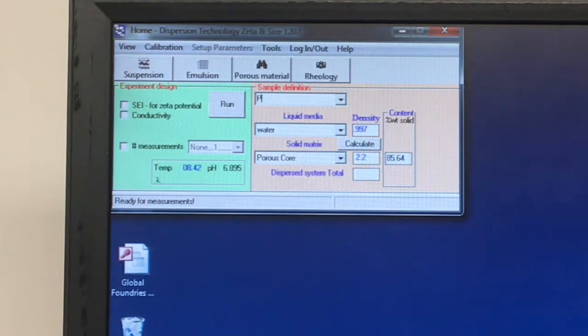Measurements take roughly 30 seconds to complete, after which time the analysis window will appear which reports the zeta potential of your system.